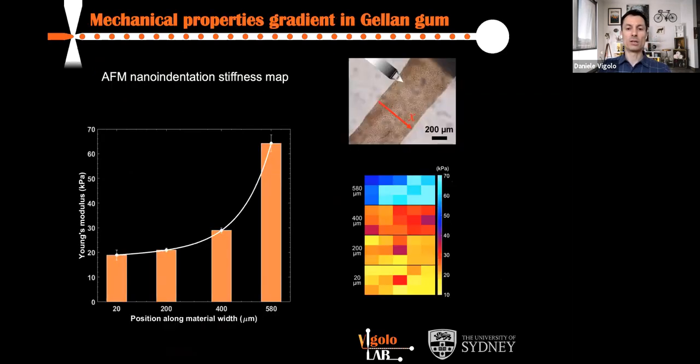As you can see here, this is just an example where we can impose a larger temperature gradient. And when I say a larger temperature gradient, we are still discussing 3-4 degrees across the material. We're not discussing much more difference in temperature, but the gradient being across the material so small is quite strong.